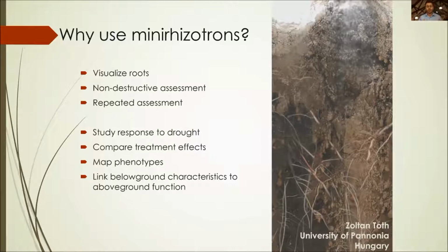So minirhizotrons have been utilized to study, again, plant response to drought conditions, compare treatments over time, my personal favorite, map phenotypes to genotypes, and overall find correlations between below ground characteristics and above ground function.